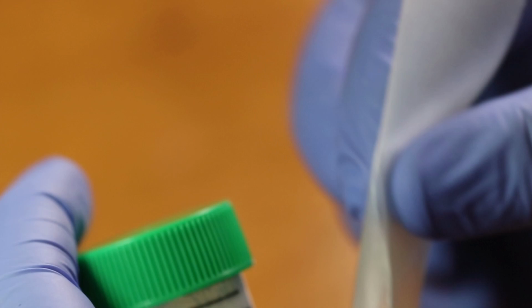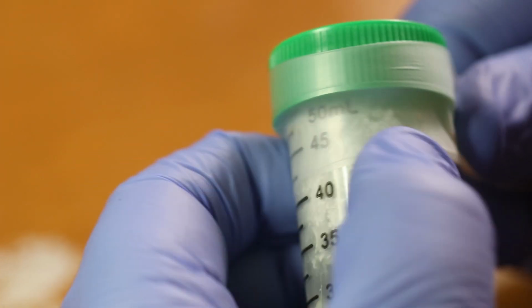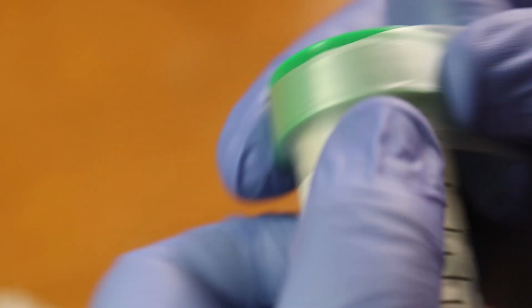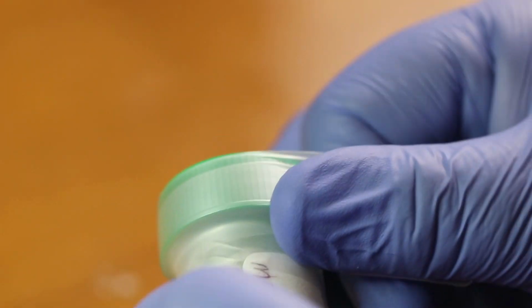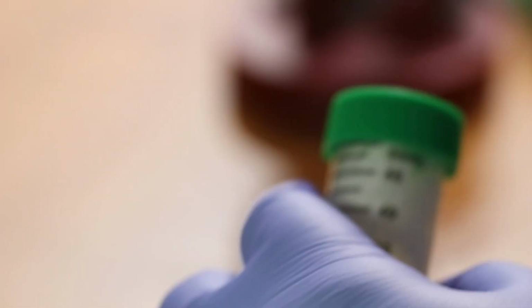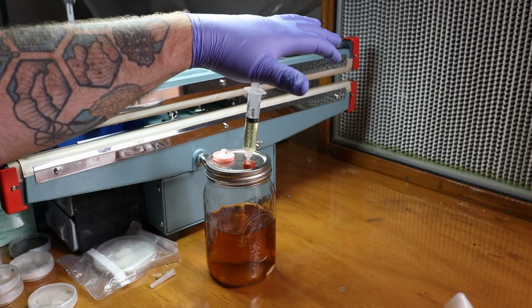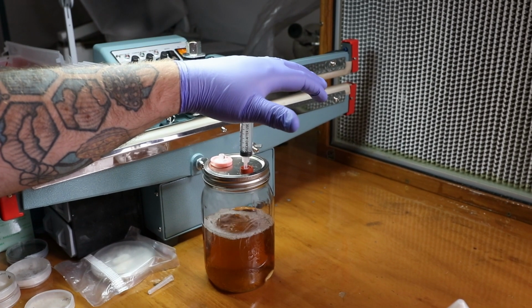We're then going to grip our agar slant, and you're going to notice how I kind of grip the lid. This is so that the lid doesn't get tension on it and go flying off, kind of like I did the first time I filmed it, like there. So, you know, I don't like to show all of my mistakes. But once we get that wrapped up, here's another with me just depressing.